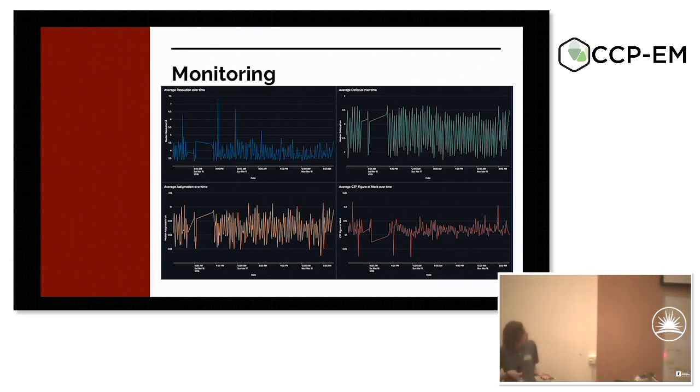So in real time, we can plot several CTF parameters, so CTF max resolution, focus parameters, astigmatism, and figure of merit. Again, the exact values of these aren't so important. It's more noticing aberrations and differences from the kind of normal operation. So this, again, is a fairly normal data collection. Everything's proceeding along. You can see a large pause in the middle where the users stop their data collection in order to add a bunch more acquisition areas before restarting it again overnight. So this is what we want to see most of the time.